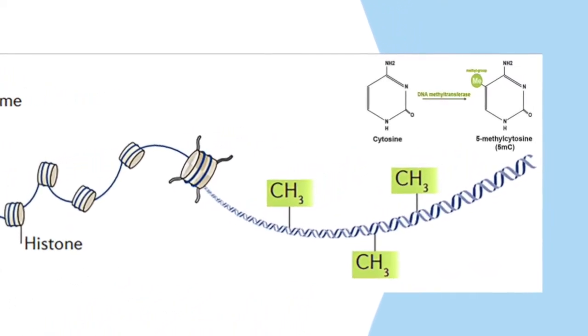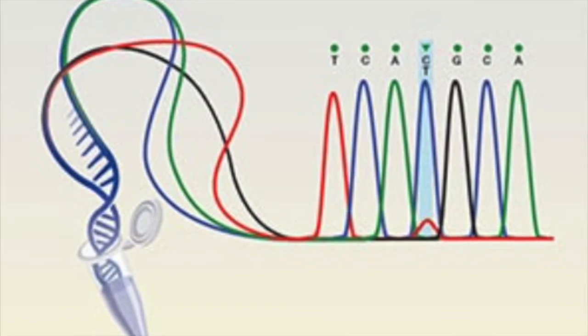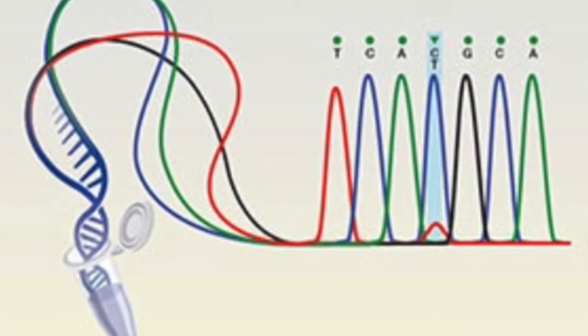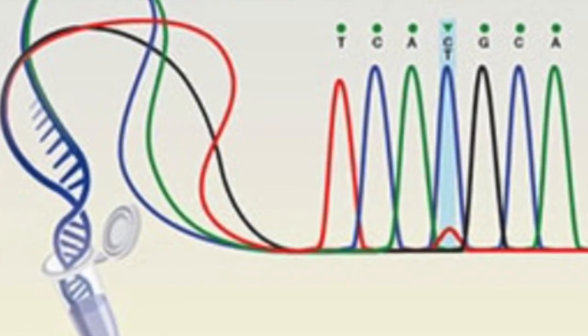It has demonstrated the feasibility of the direct PCR sequencing workflow for the analysis of methylation in bisulfite converted DNA from cell lines and FFPE samples using reagents, equipment, and software. With this, we have faster results of methylation studies, and it opens possibilities for uses in retrospective research.